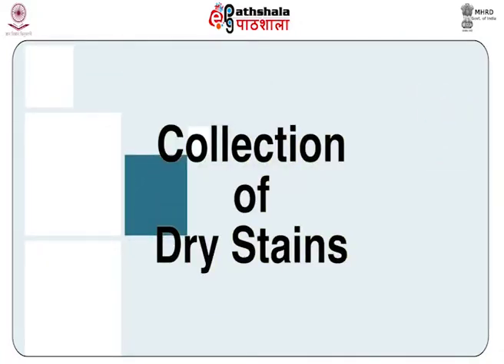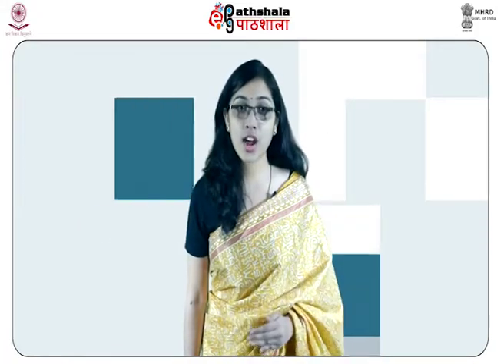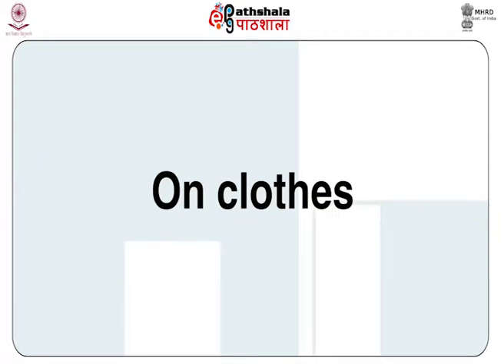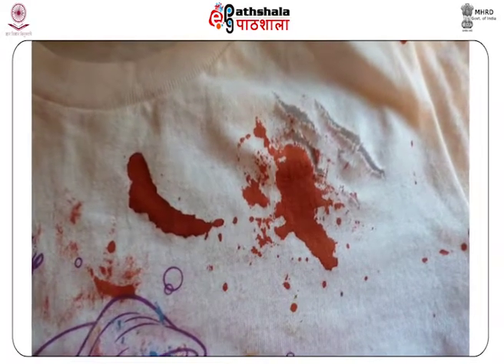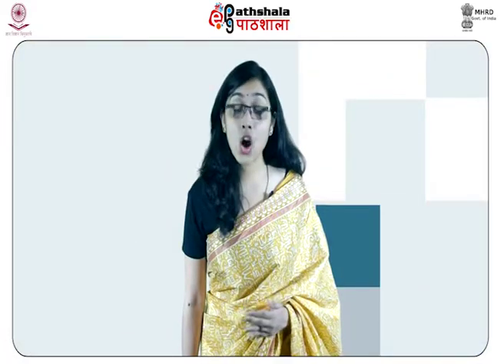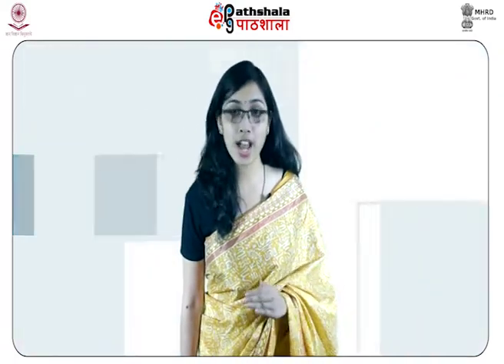Now about the collection of dry stains. In collection of dry stains from the scene, the following situations are common. First, on clothes. Take possession of the clothes bearing the dry stains. The number, position and size of the stains are properly recorded. The stains on different clothes or on the same clothes are not allowed to contaminate one another through dislodgement during packing or transit.